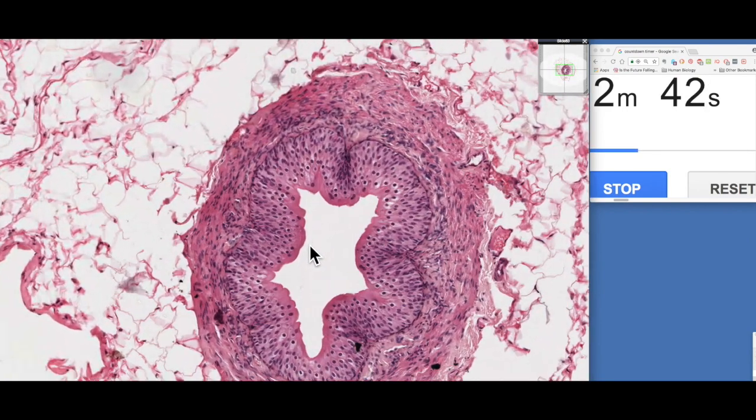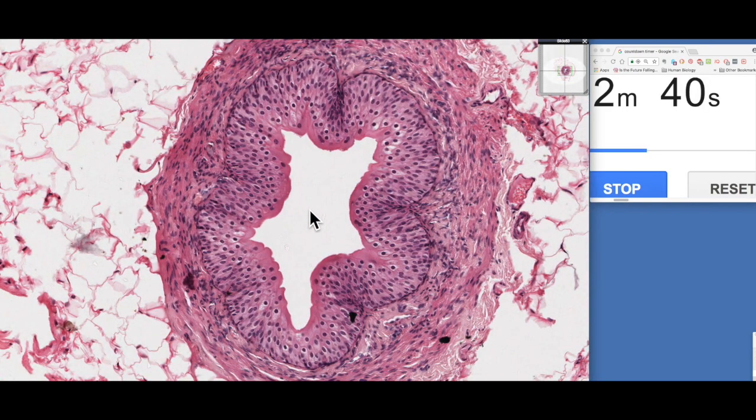the ureter is lined by a specialized type of epithelium known as urothelium, or urinary epithelium, or transitional epithelium. It's made up of a stratified epithelium in which its cells are actually able to undergo a large amount of stretch.